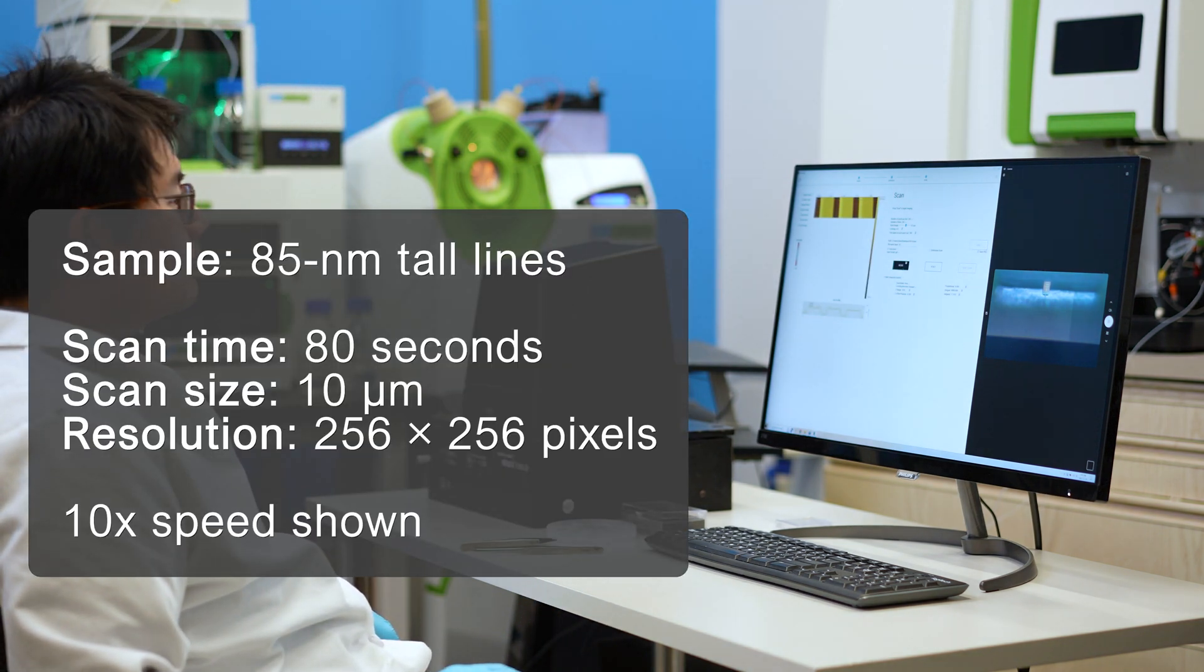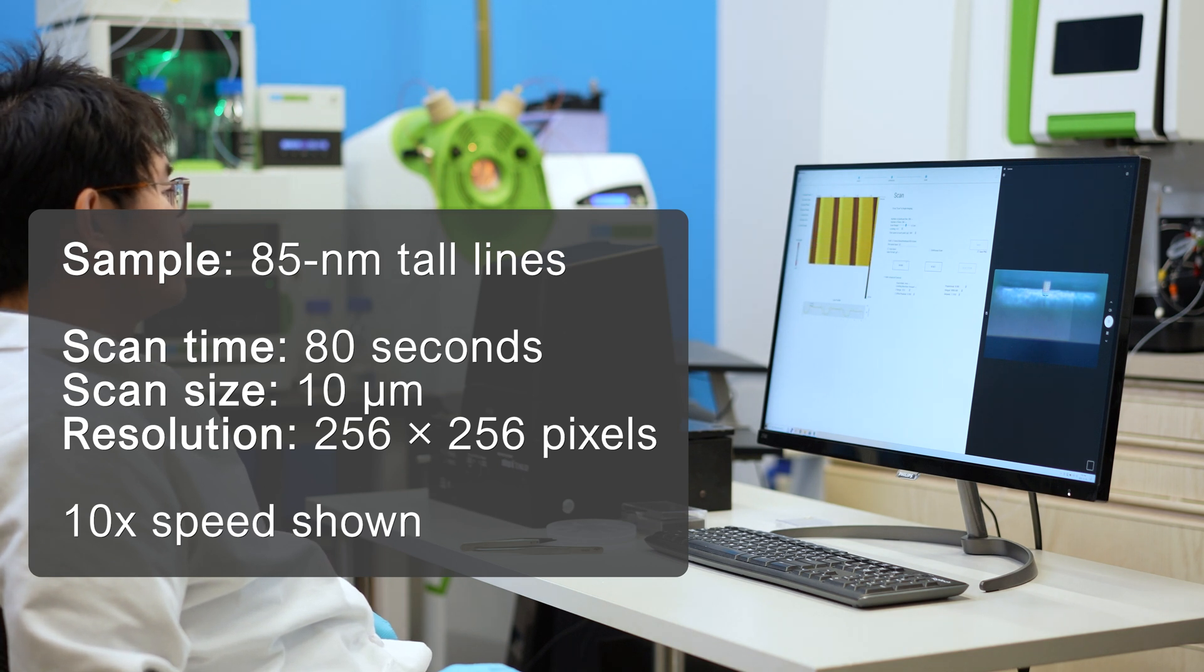Here we're scanning 85 nanometer tall lines. Routine scans take just 80 seconds to complete.